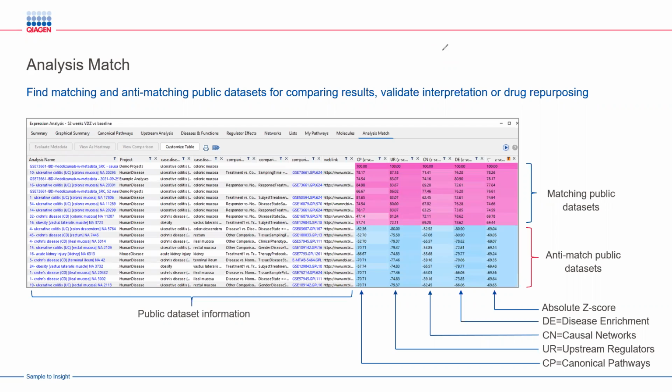You are working with a mouse model and you ran an RNA sequencing analysis, and you want to see how well the model is reflected in terms of these biological signatures. So you can easily find public data sets that use maybe other mouse models or data sets coming from human patients, and you can see how well your biological signatures from your mouse model are matching with these public data sets. So that's one way to validate your own findings. You can feel confident about your own results.